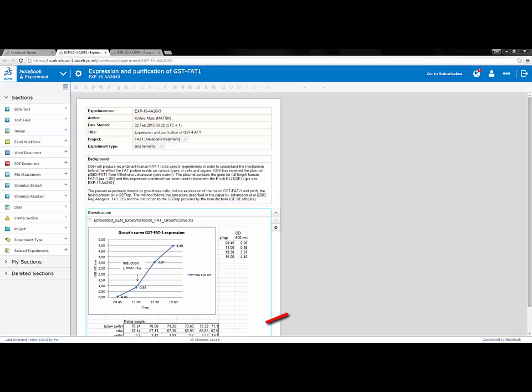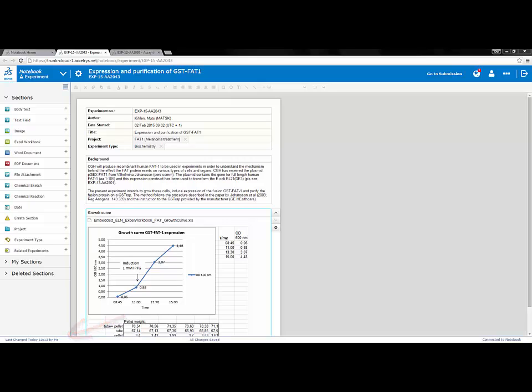Within the experiment editor, at the bottom of the page you will see the save status. At the bottom left hand of the experiment, you will also see a timestamp and the last user to edit that experiment.